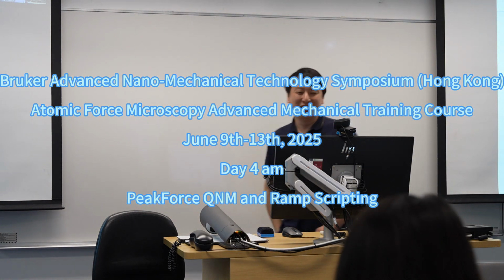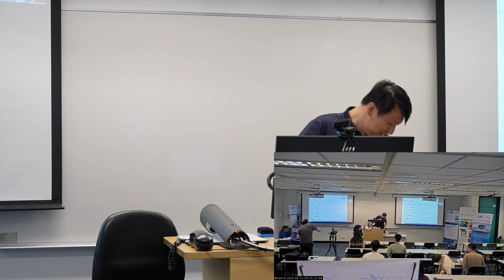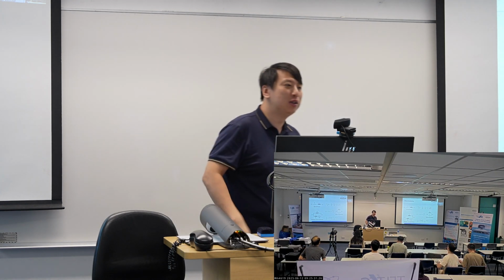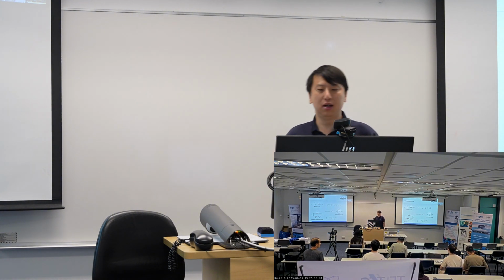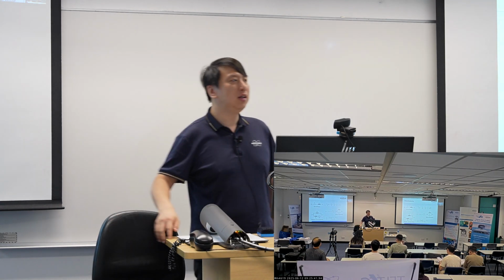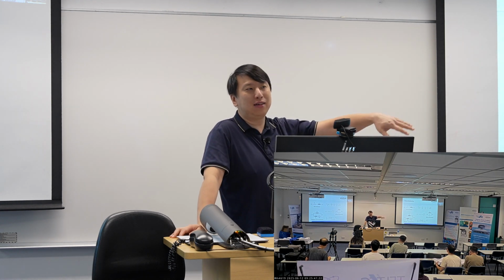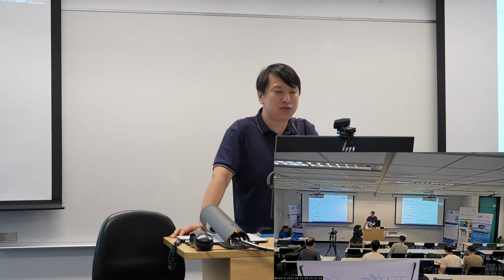Okay, let's continue. Today's topic in our schedule is the so-called advanced force spectroscopy. The main idea is that we want to add a segment of hold inside our force curves. That means once the probe touches the surface and reaches the defined force, we let the probe stay on the surface for a while, and then study the stiffness or modulus change.